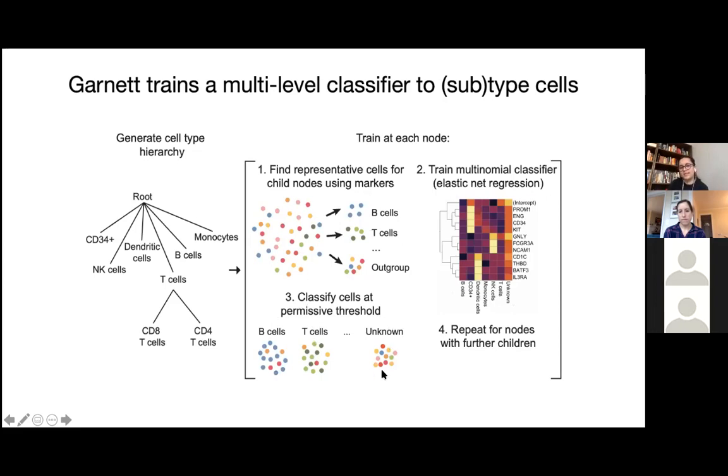And then one set will be called unknown, where it can have like 10 types of cells in it. And then this is repeated if you have a very large data set, because you're going to have several clusters that are either very closely related or completely apart because they're completely different cell types.